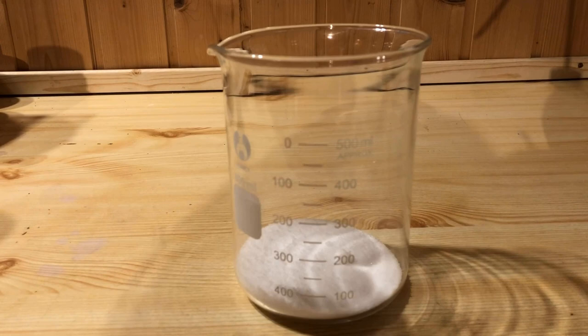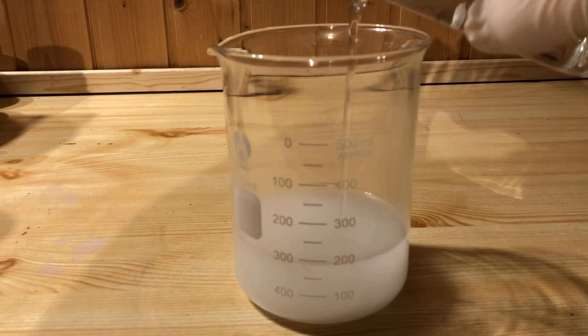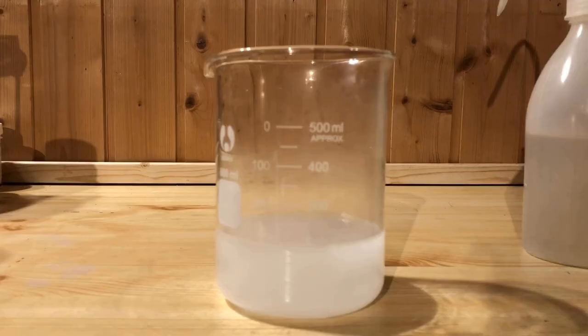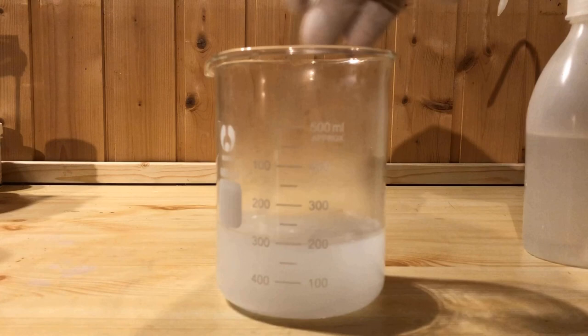A beaker containing 64 grams of sodium hydroxide is filled up to the 200 milliliters mark with distilled water. Stir with the glass rod until the sodium hydroxide is completely dissolved. The solution becomes very hot and is very corrosive.